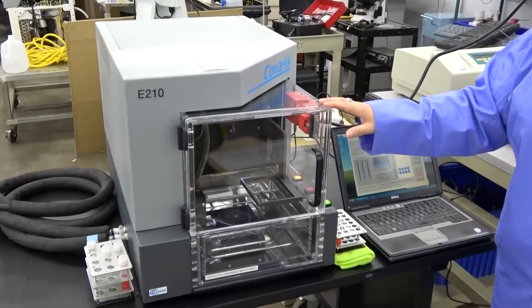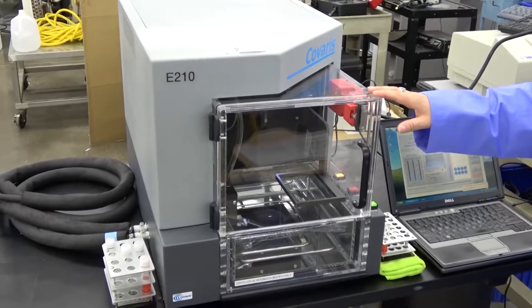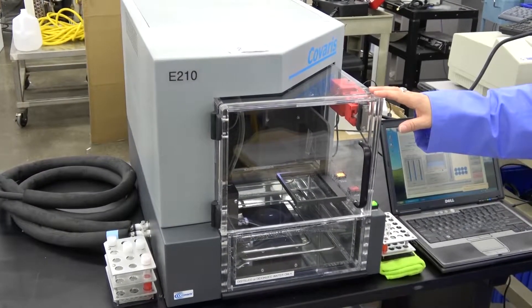This instrument delivers controlled and highly focused non-linear acoustic waves to each sample.